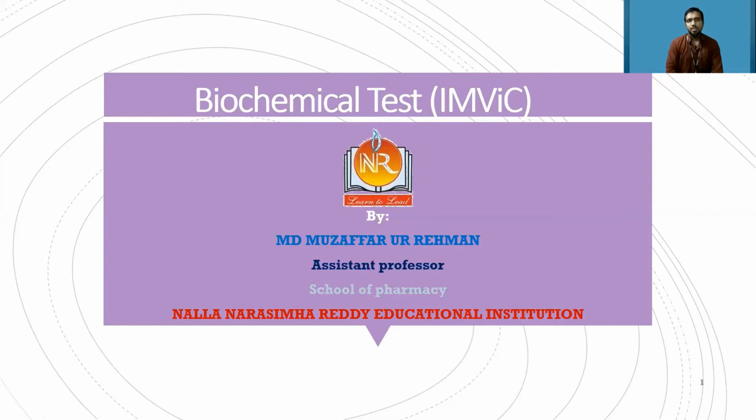What do we do in staining techniques? In staining techniques, we impart some color to the microorganism in order to identify them under microscope. It could be either presence of a spore or flagella or nuclear material, or based on if it is gram positive, gram negative, or if it is a mycobacterium species or not. All this can be possible with the help of staining techniques.